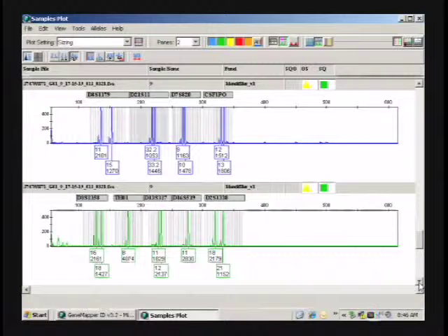I wasn't sure. I see that there's a lot of pull up from the orange channel. Yeah, there is a lot. Do you find that you have to reduce the amount of LIZ that you add because there's less species competing for injection, or is it just a bad spectral? It may be just a bad spectral. I've not seen this much pull up before, honestly. I've never had a pull up problem coming from orange with MinElute before. So this isn't something I've seen consistently. This is actually the first time I'm seeing all this pull up.